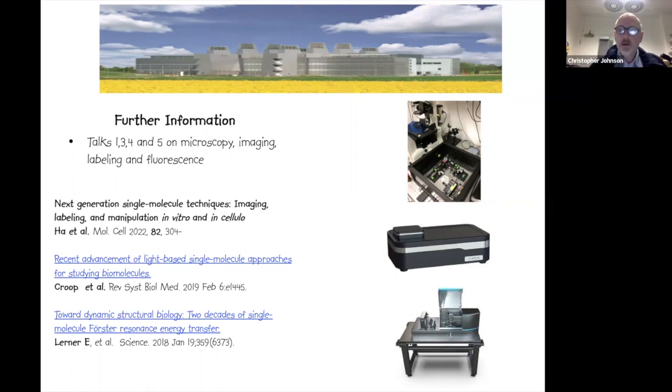And in that case, you can measure samples at 20, 30 mg per mL, if you so wish. And that might have implications in terms of some other orthogonal experimental approach that you're using, such as crystallography or otherwise. I am also surprised it's not more widely used. I think perhaps we're trying to promote it as a technique, and it is also very simple to use, and it's very easy to train people to obtain data on it.